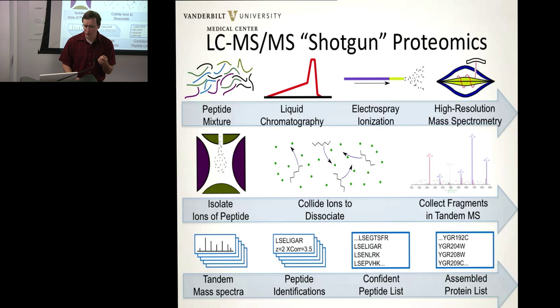So we're just using reverse phase liquid chromatography. These beads are covered with carbon 18 chains. The peptides stick to those nicely, but not so strongly that we can't get those peptides back. Now, the gradient I've shown here in red is just showing the increasing amount of acetonitrile, or whatever hydrophobic solvent we're using, to compete the peptides off of the beads that they're stuck to. At a particular moment in time, over say an hour-long gradient, those peptides are going to be competed off of the beads and flow into the mass spec.